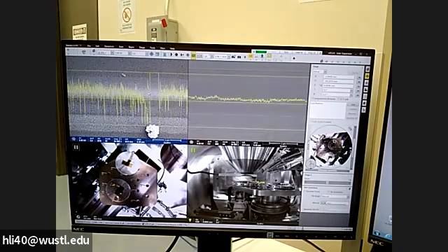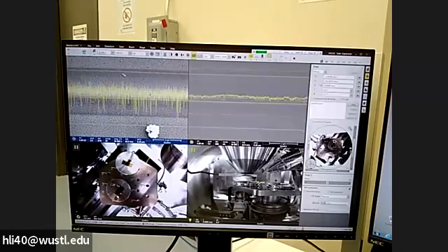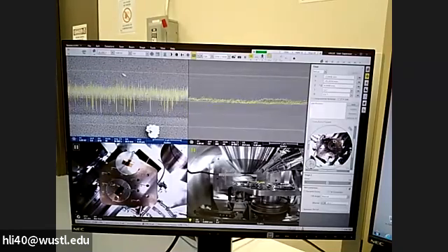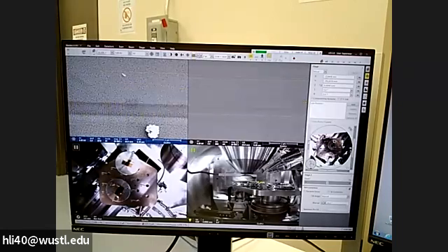Again, if your sample is sensitive, you try to avoid this region. You do the adjustment nearby and then come back. Okay. So after you did all this, I suggest using the pause button rather than the photo button. The photo button is a preset scanning speed and wait time for you. So maybe that's not the option you like. If you choose the right option, just simply click the pause button.